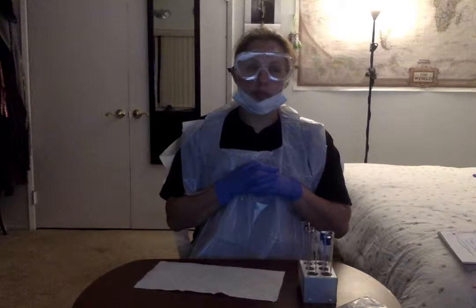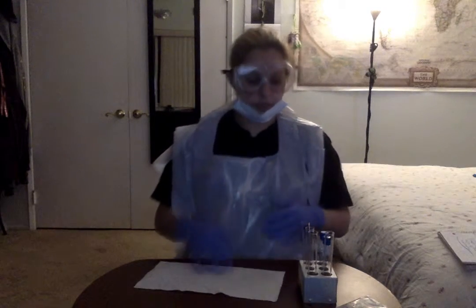The date is February 2nd, 2018, and in today's video we're going to be going over biochemical testing and microbial identification. We did this with two different experiments this week. We did the methyl red with the Voges-Proskauer test. I'm not sure if I'm pronouncing that correctly, but you know what I mean. So that was one part of the lab. And then the second part of the lab was a catalase testing.